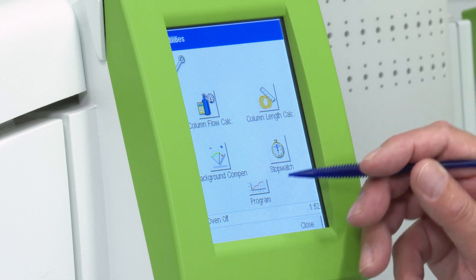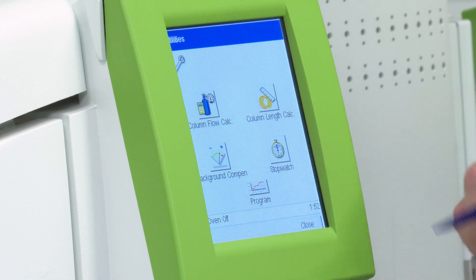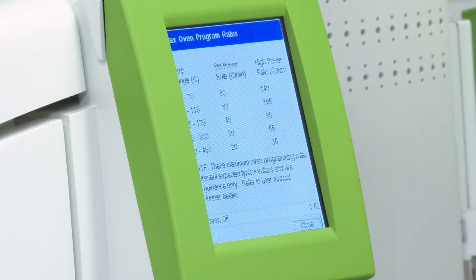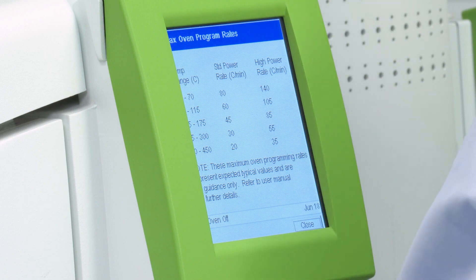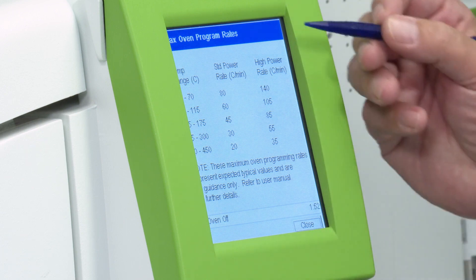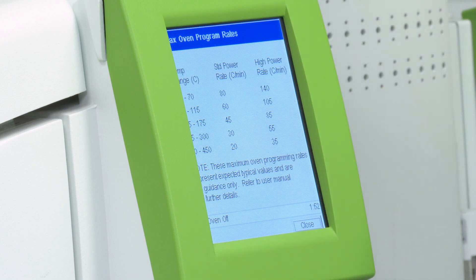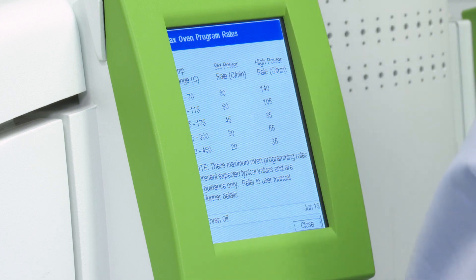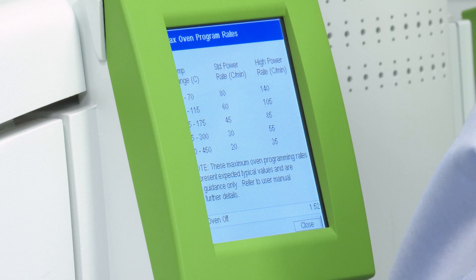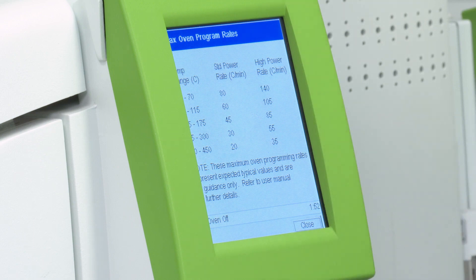We have another one called a program that is on the 690 but not on the 590. What this does is it gives you a nice little graphical, text interface of the maximum temperature ramp that you can do for certain temperatures on the GC, for both the standard power model and the high power model.